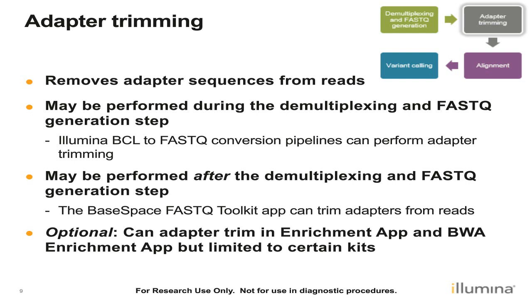There's also the option for some library prep kits to trim within the BaseSpace Enrichment and BWA Enrichment apps, but this is limited to certain Illumina kits. So if the kit that was used is not one of these, you would need to trim adapters before running the analysis.